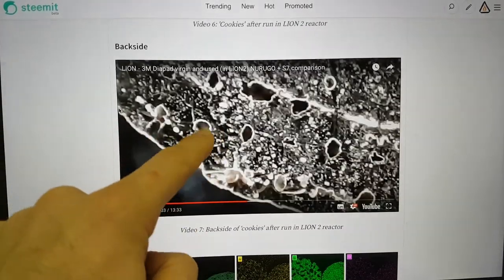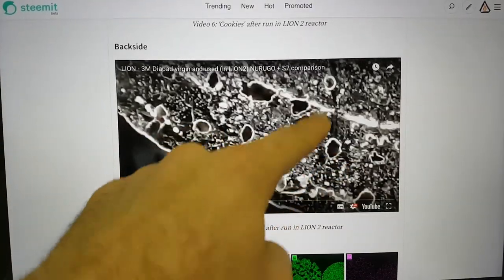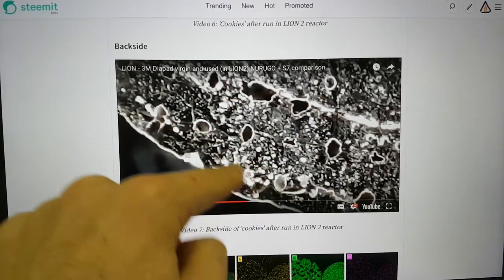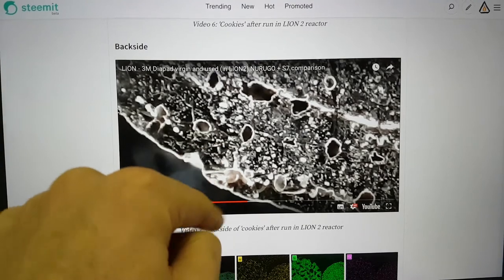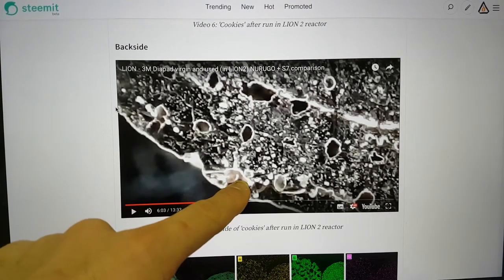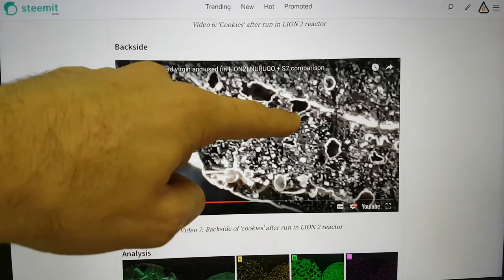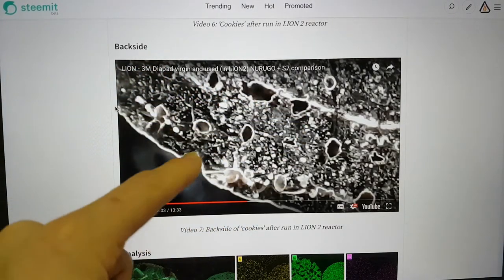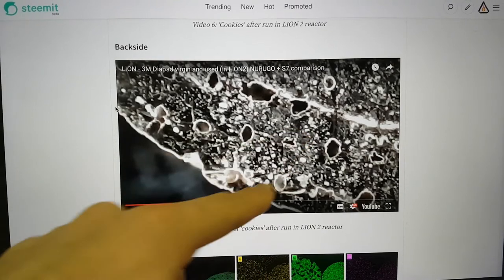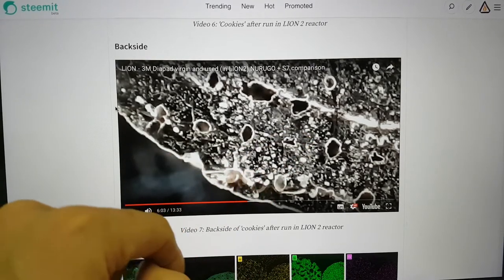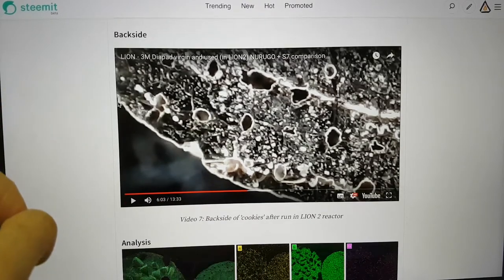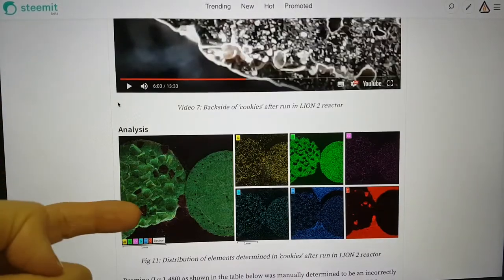On the backside, again, there seemed to be degradation in the nickel structure and bits missing. When you go in even finer, there are holes with spheres. Here's a nice little pearly colored sphere. And in the cracking here, there is a black sphere. There's various spheres of potentially different elements or materials or compounds. So what did it actually look like under analysis?